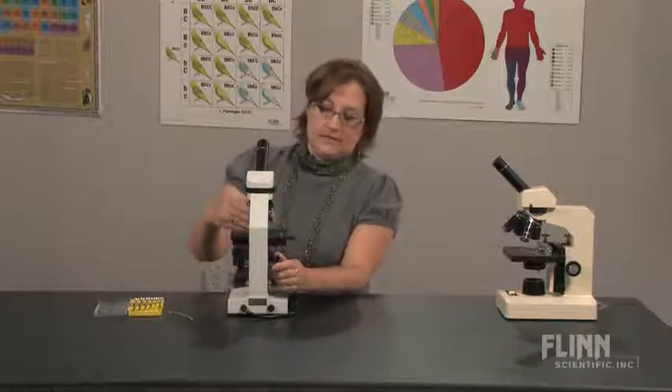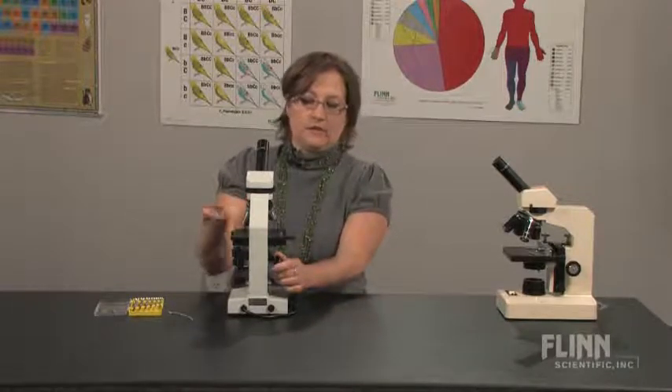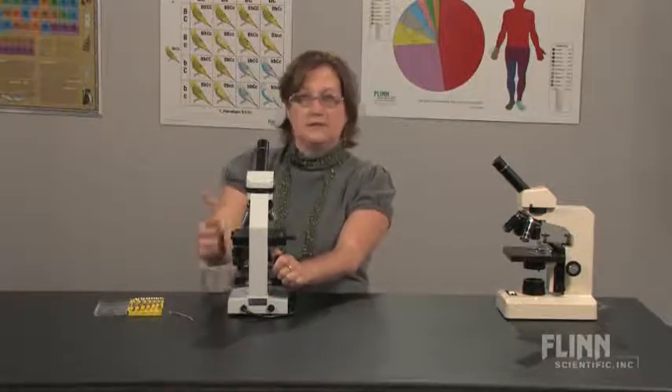You need to be careful that you don't pull the stage up so high that when they go to oil immersion they can rack the stage into the objective and damage it.